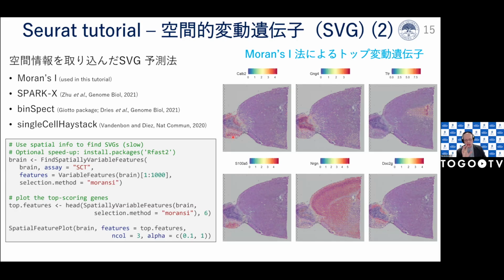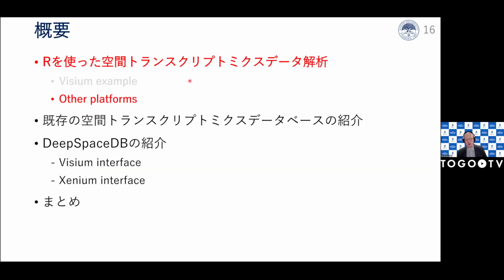So this one has a high expression here and not here. And here is similar, so here and not here. This one very high here, but not here. So of course, it works. And now finally, actually, we are using the spatial component of this data. So here, I will stop the introduction of R.